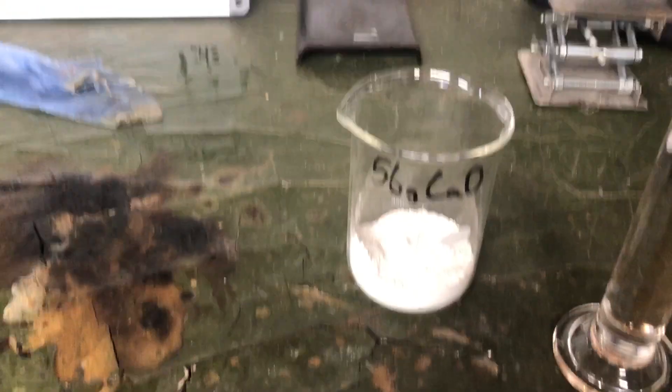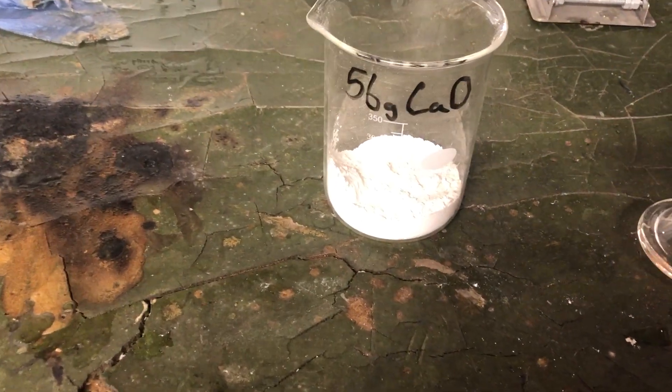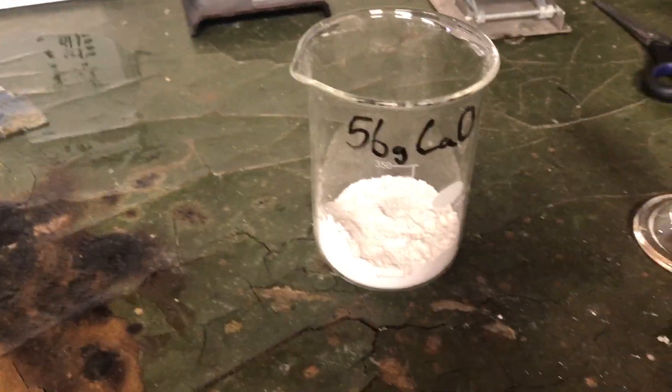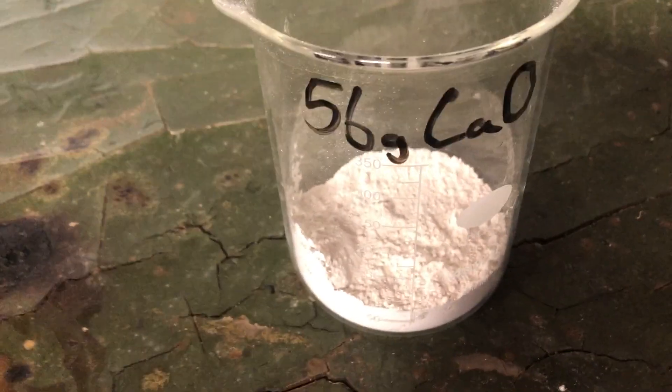Right now I'm about to add 100 millilitres of 50% phosphoric acid to one mole of calcium oxide. This should form calcium phosphate, which is the main compound in bone, which is quite interesting.